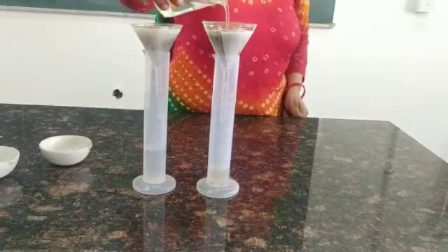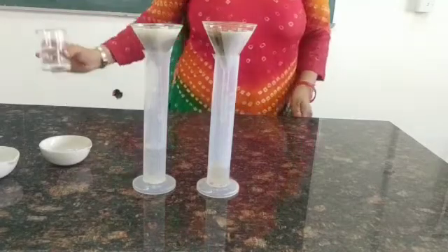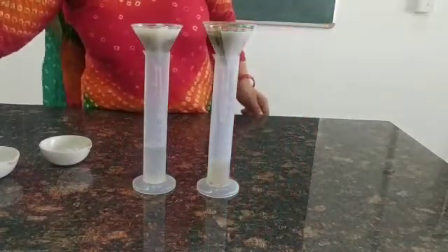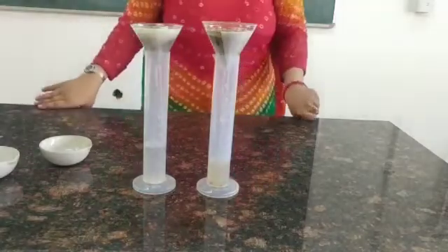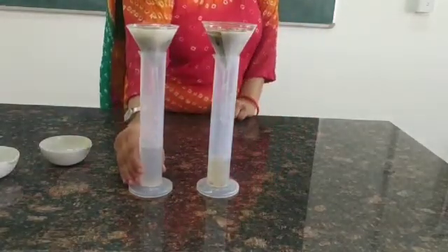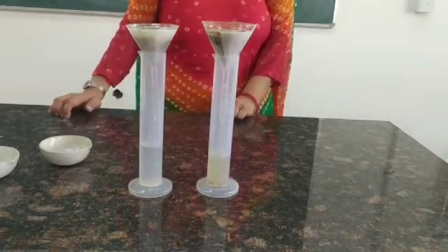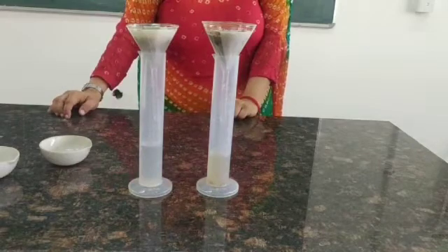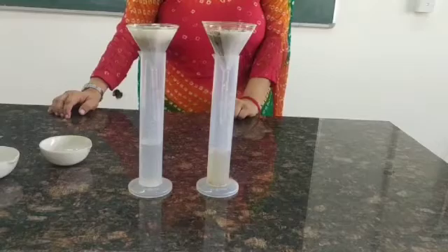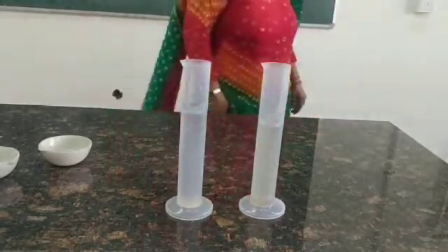When the water stops dripping down, we are going to remove the funnel and note down the reading — the amount of water that is present inside the measuring cylinder. We have to carefully note down the observation: the amount of water in both the cylinders to determine the water holding capacity of the soil.